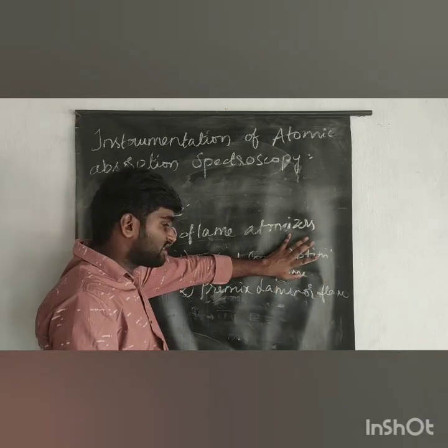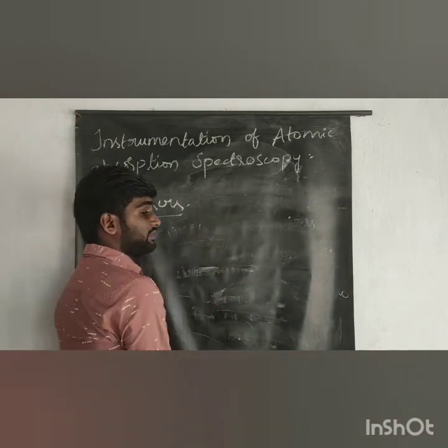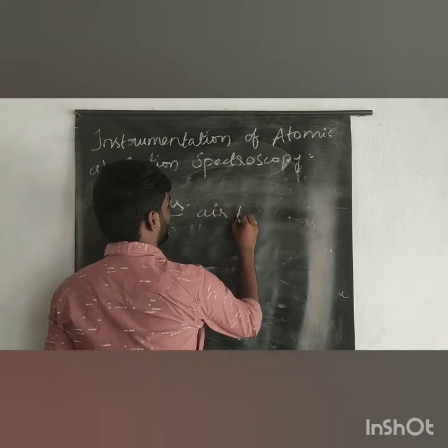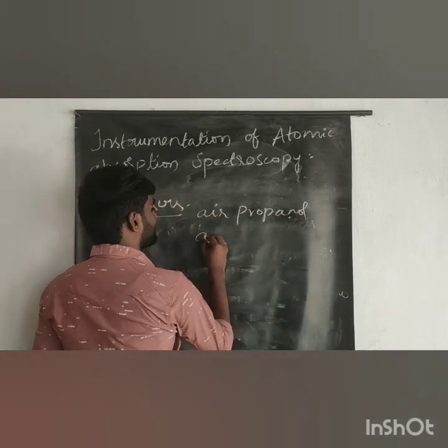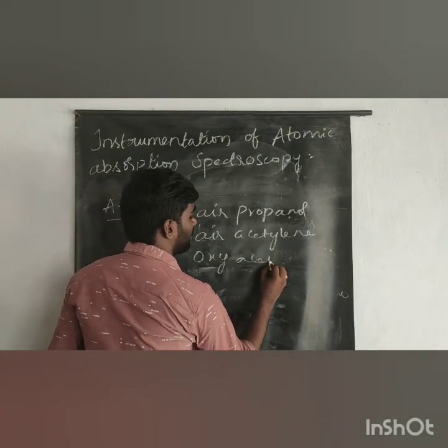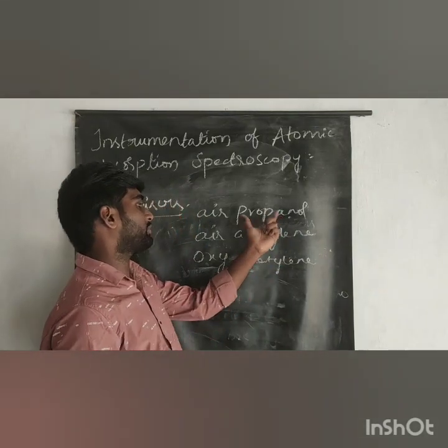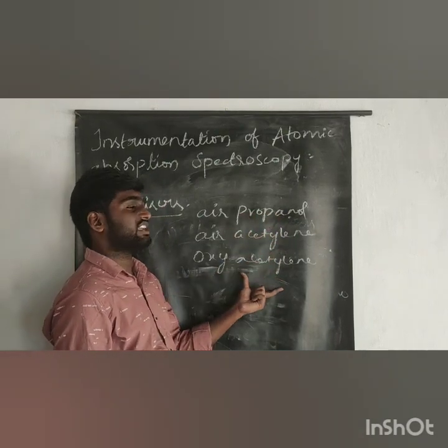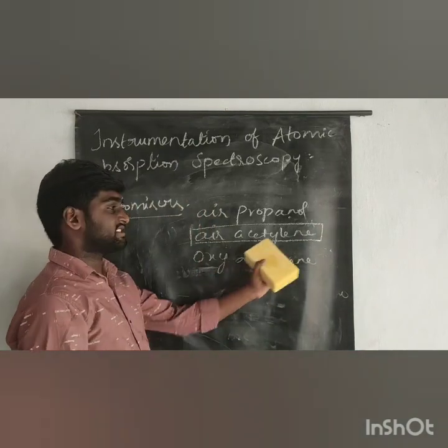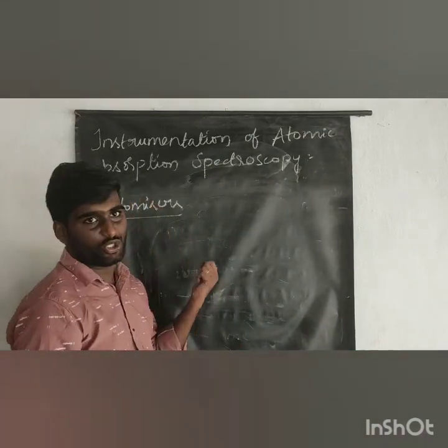Before going to the total consumption flame and premix laminar flame, I want to introduce what the flame is. In this flame we can use air propane, air acetylene and oxyacetylene. These types of flames are used in the atomizers. Most widely used is the air acetylene flame.